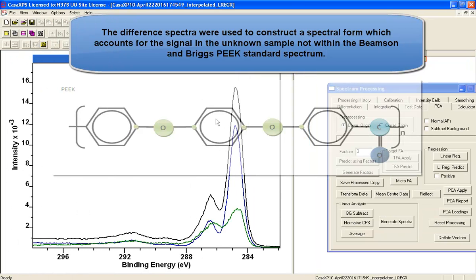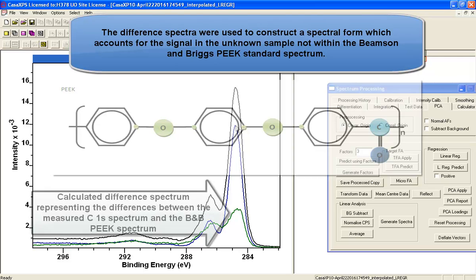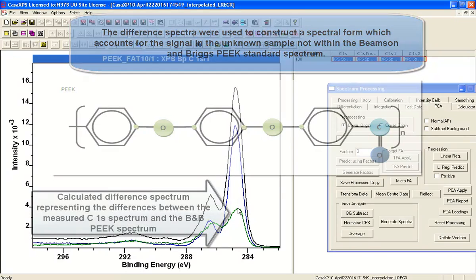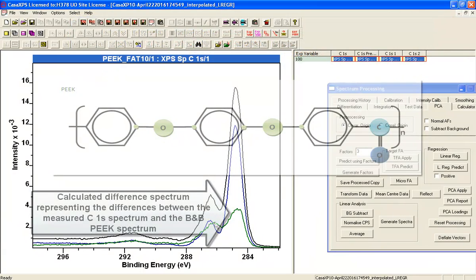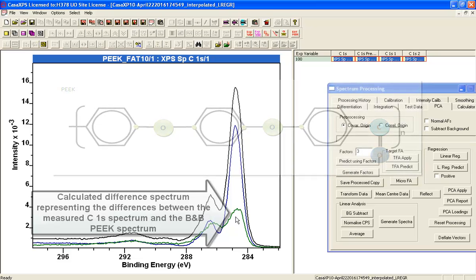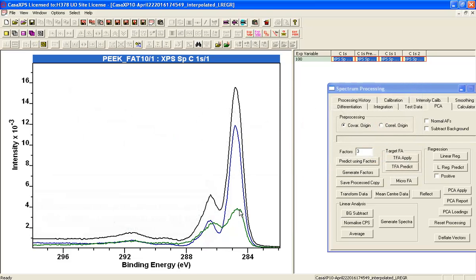The unknown one is made up in terms of the original spectrum or the spectrum from Beamson and Briggs and some modification that's required in order to obtain a reproduction of the data. So that gives me an idea that the data that I've measured has a component of PEEK in it. It also has something else in it that I need to investigate.